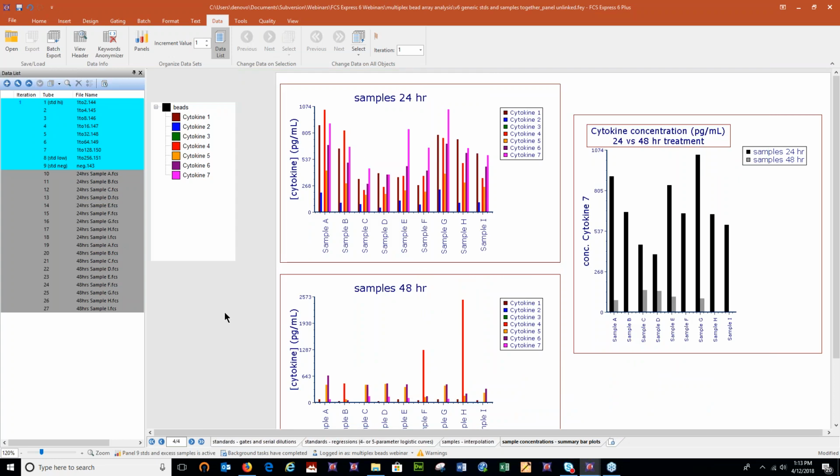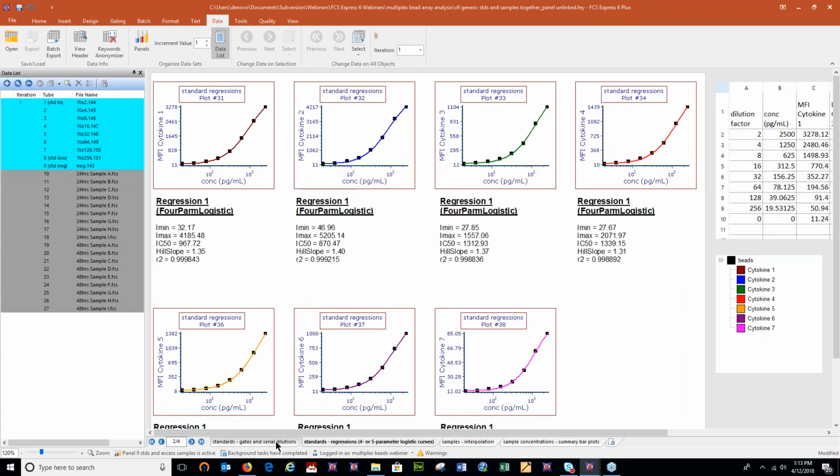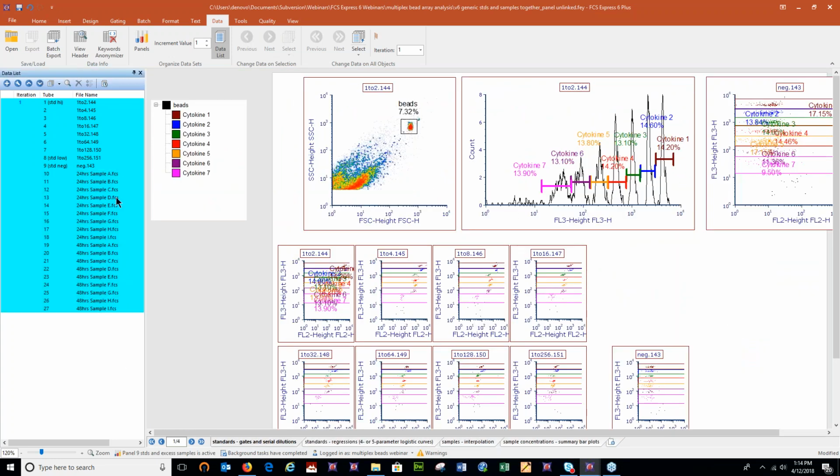Okay, so I know I went through that pretty quick, but I just wanted to show you, if you're keeping track, that was probably less than 15-20 seconds of loading the samples into the data list, and everything is already set and ready to go. So that's our goal. We want to take you to that point where you're able to make a template like this, and it probably won't take you more than, well, it depends on the complexity, but we're going to fit it all in today in a portion of today's webinar, and then you'll be able to reuse it over and over again.